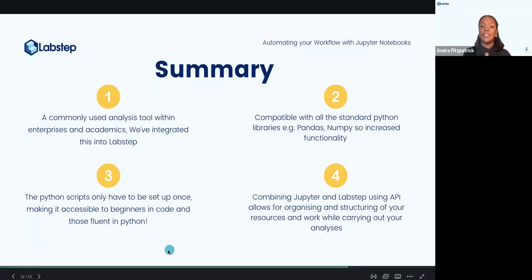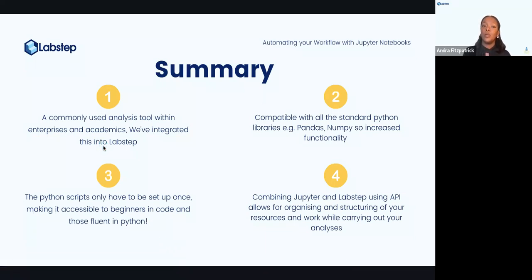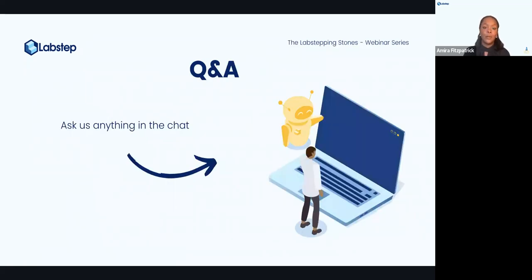Amazing. And I think it's so interesting as well to get that sort of move towards API. I mean, API is spoken about in so many different industries. So it's nice to know that Labstep is integrating this and making sure that everyone is using this sort of really common industry tool. So let's jump into some questions.